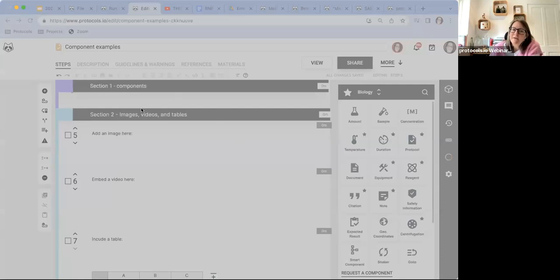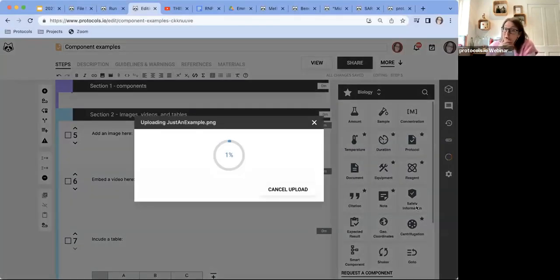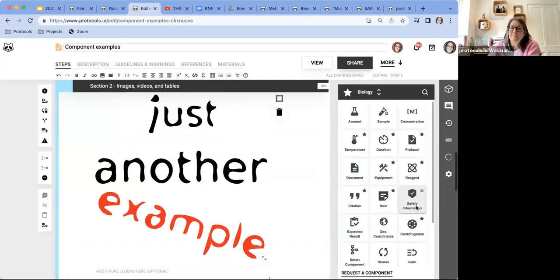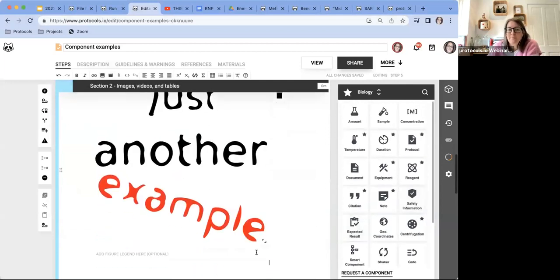You can navigate to wherever the content is on your computer or drive or wherever you're working. Find the image that you want to add in. So maybe you've got a picture of the setup. Maybe you've got a little movie of how you do things. So if they're short movies from your phone, you can add them using this functionality like this. So it pops it in.